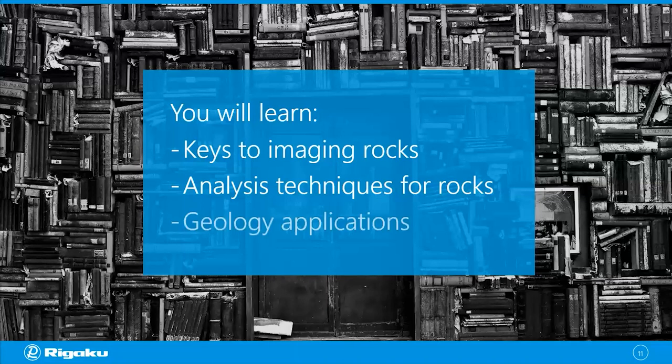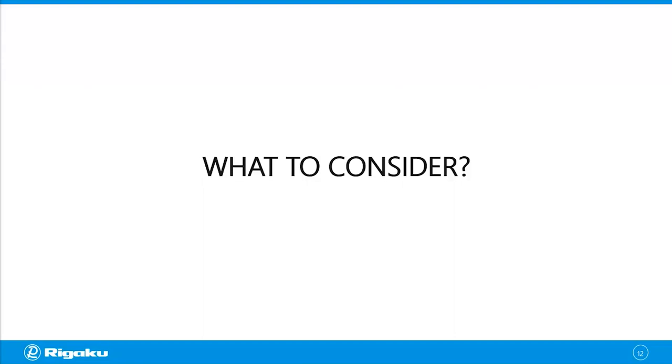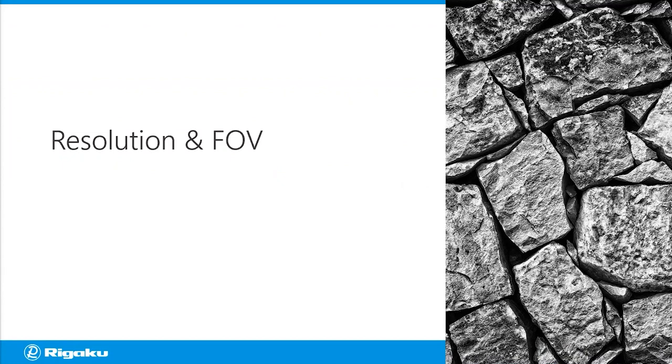Now, when we scan rocks, what should we consider? What we need to consider here is not that different from what we have been discussing in the previous webinars. So we want to think about the resolution and the field of view. We also want to think about the contrast. Now, let's talk about the resolution and the field of view first. I'm putting those two parameters in the same category because they are related to each other.